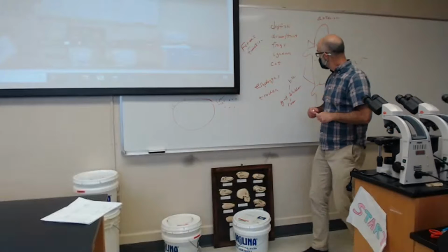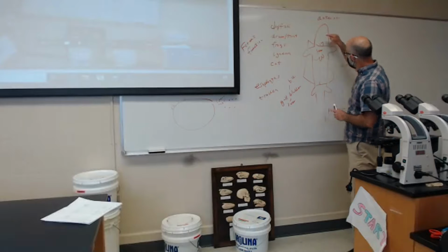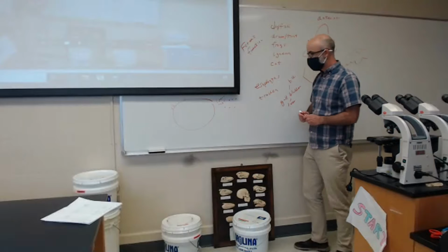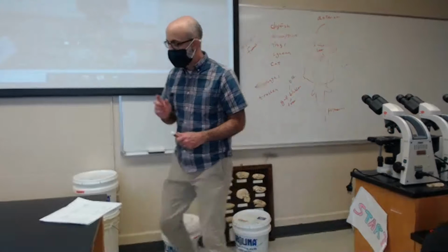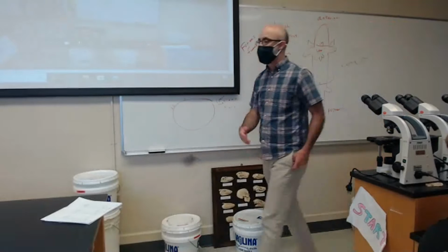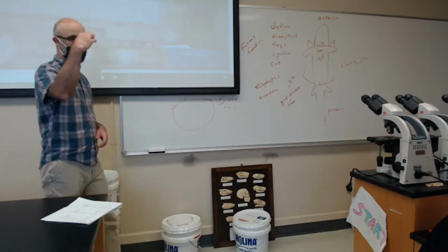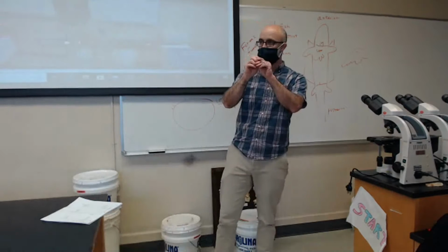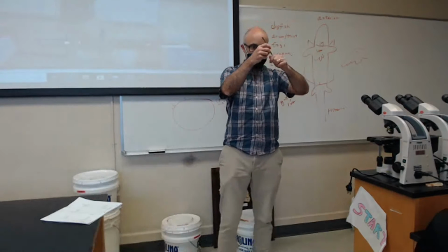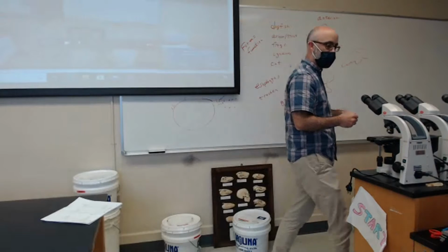Okay. So the gallbladder would be like here. Now, the stomach is another large organ. Again, I like when you have a dissected specimen in front of you. I'm a big proponent of this tool right here. That's a blunt probe. Take the frog, it's dead, put it down its mouth through the esophagus, and see where it goes. It's going to go from the esophagus down into the stomach. The stomach is the large pocket of the gastrointestinal tract.